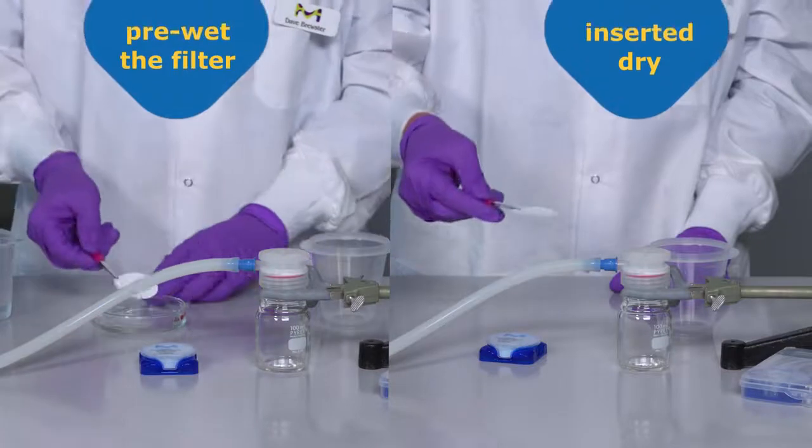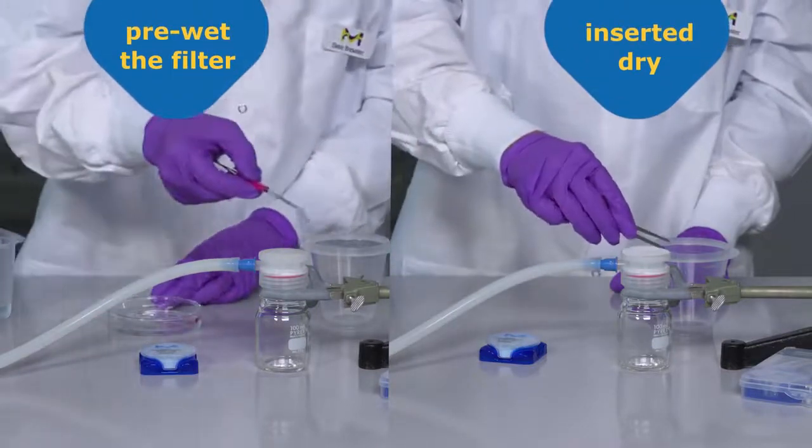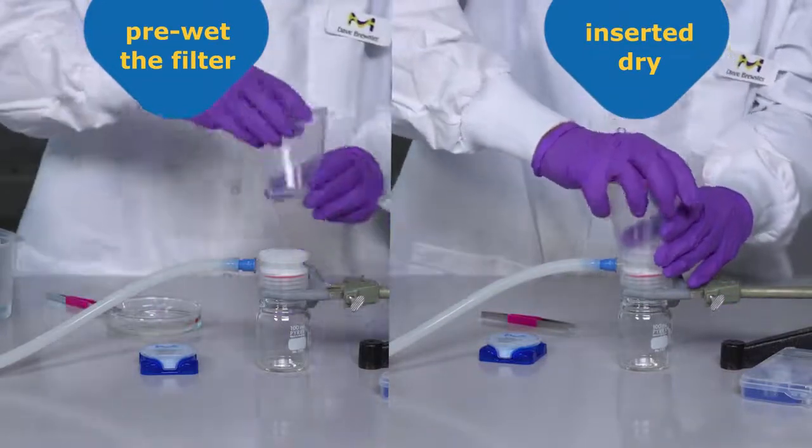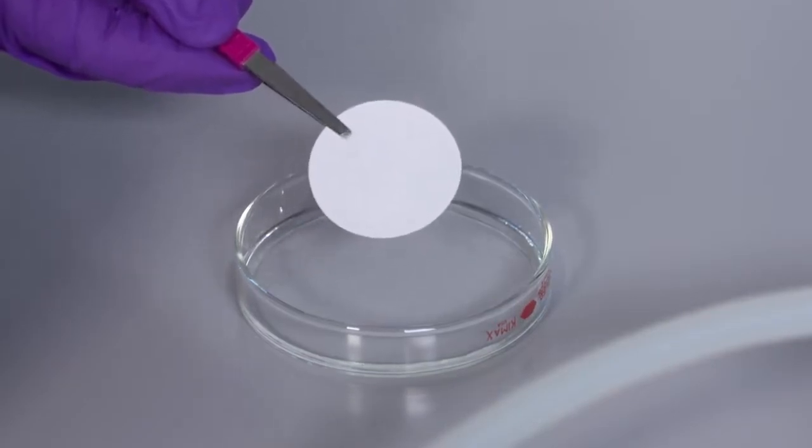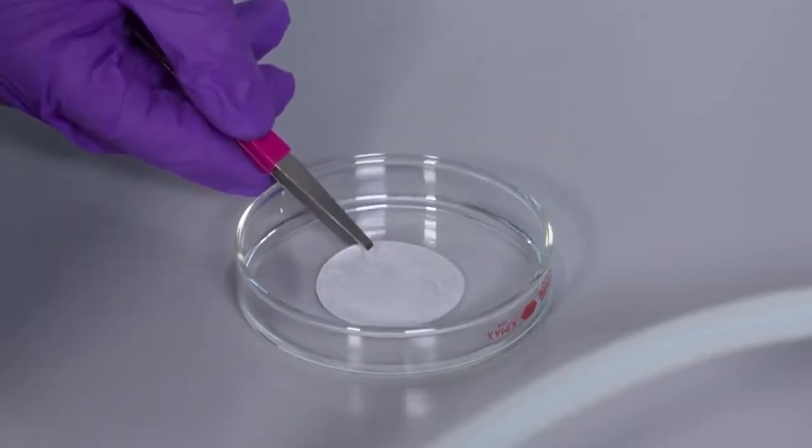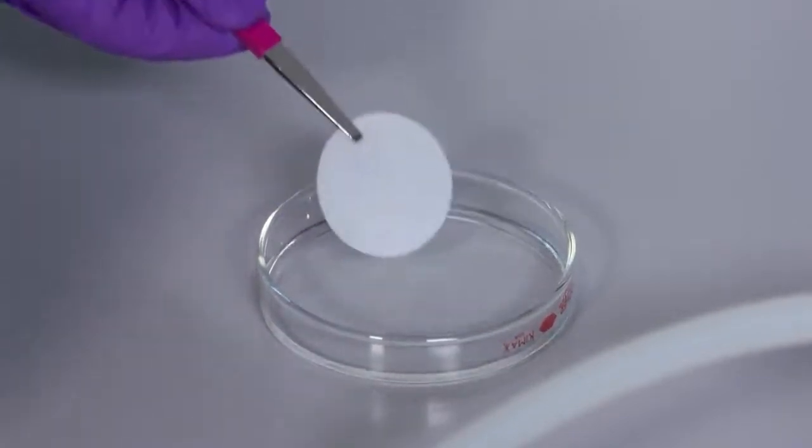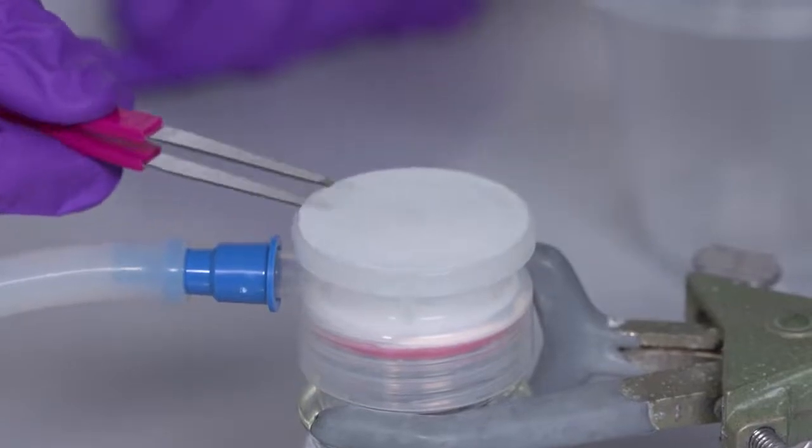When using the Natrix Q membrane, you may choose to pre-wet the membrane or insert it in the setup dry. In this case, we will pre-wet the membrane with Millicu deionized water. We will then insert the pre-wet membrane into the Millicupflex assembly on the receiving container.